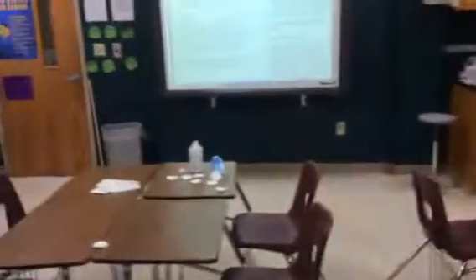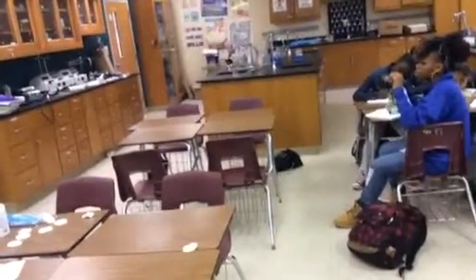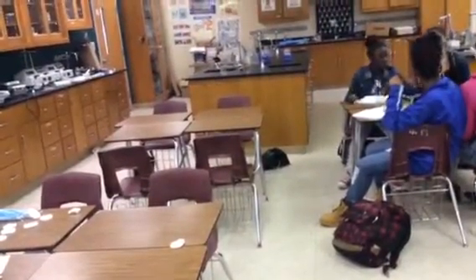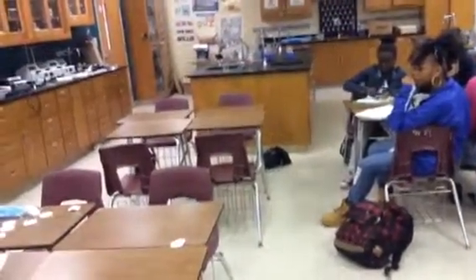Okay, quick questions. How much of each are you putting in your test tubes? 0.5 milliliters. That will be your constant variable, right? Because you put the same in each. 0.5 milliliters.